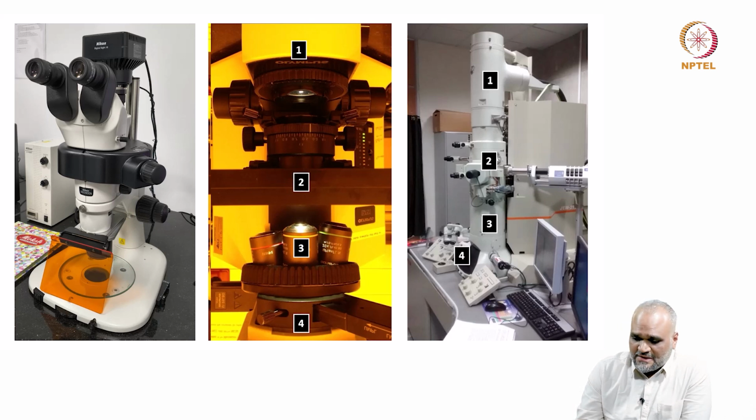In this particular microscope model that you see here, this is a lanthanum hexaboride filament TEM, and there's a particular reason why I want to draw this analogy, because if I understand the basic construction and the layout of a microscope, most commonly the microscopes are like this, vertically standing, and the column is such that my source is on the top.